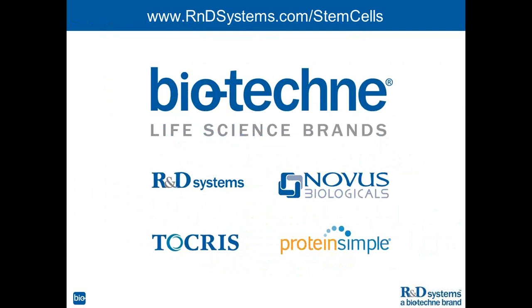Joy, I'm just going to read a couple of questions out to you that perhaps people would be interested in hearing your answer to. So George has asked what type of equipment we need for using the Luminex assays, and we also have another question about information about the multiplex assay system. So there's two related questions there about the Luminex assays and the equipment needed. Sure. It does require a Luminex type reader, and there are different vendors available for those.